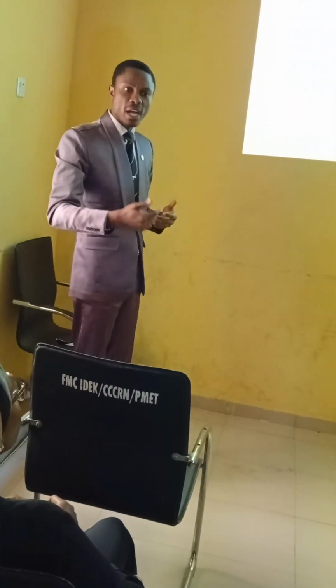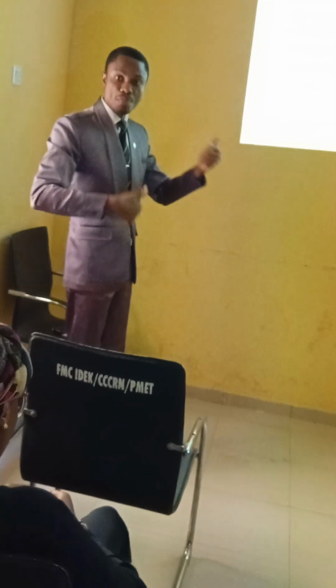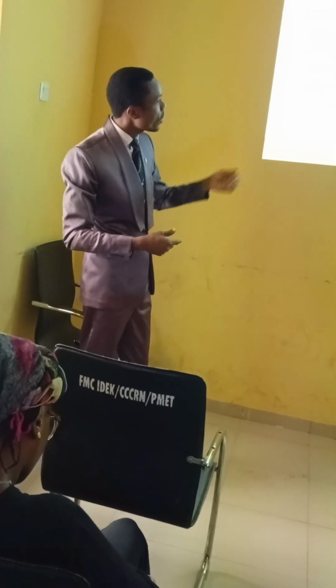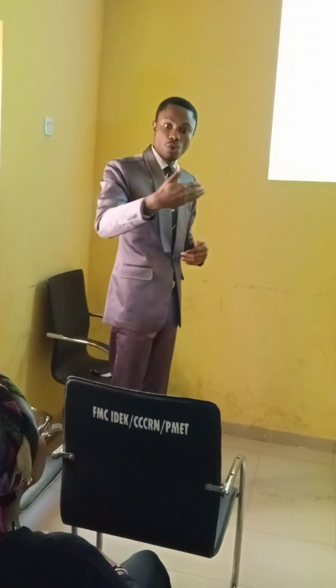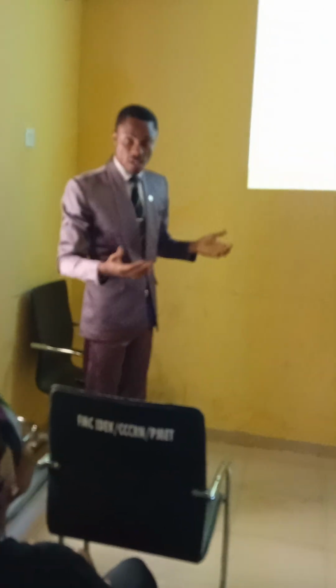If the step can be done again, you repeat it, so that you can confirm if it is truly an artifact, because there are some artifacts that can be so close to a pathological lesion, so you can identify by repeating it. If possible, you repeat it. Then the next one, you maintain a record of artifact incidents and the corrective action that was taken, so that in case that artifact is identified, the technician involved can know what to do. And then there should be continuous auditing and improvement.